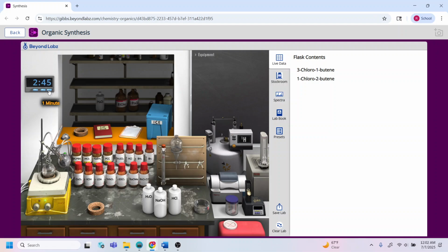So we're going to start 1 minute. So after 1 minute, we're going to bring our cursor. We did not collect anything. And see, the temperature now is 36. You're not going to collect anything unless your temperature hits 60. So we're going to do another 1 minute. Be slow in there. I don't have anything in my collection flask.